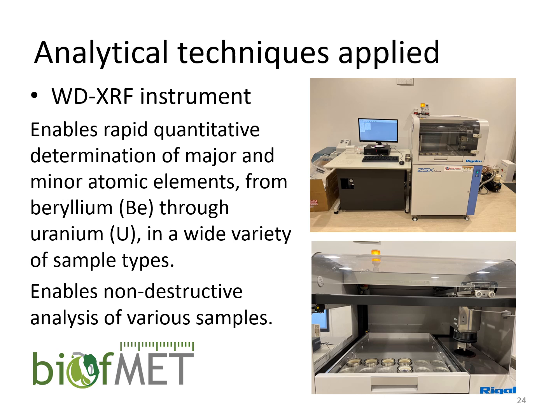Here you can see an example of a wavelength dispersive XRF instrument. This one is equipped with a lot of different crystals, so it allows you to analyze throughout the periodic system of elements from beryllium to uranium. You can also do some unknown sample scanning just to see what is present there, but of course for quantitative analysis some standards are also required for calibration. Standards also need to be in the same form as the samples, and that is actually what we are trying to develop in this project.